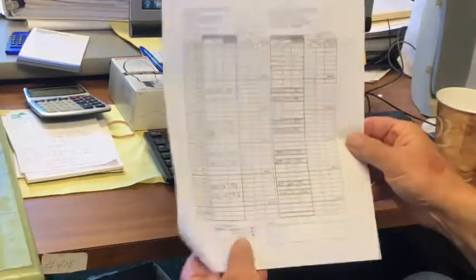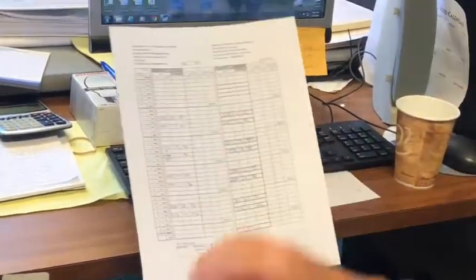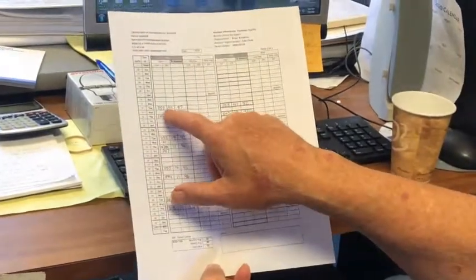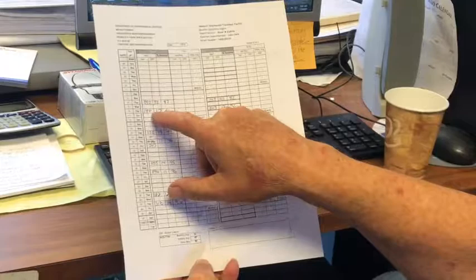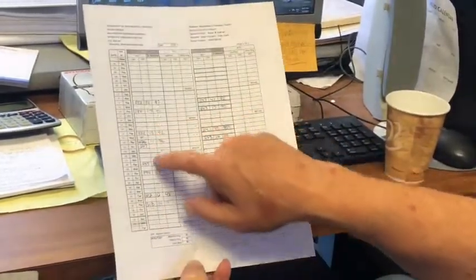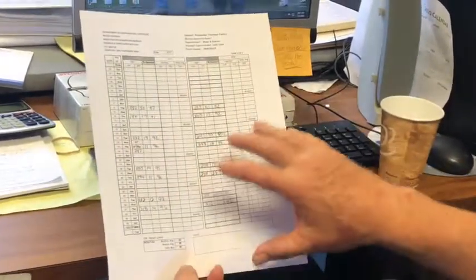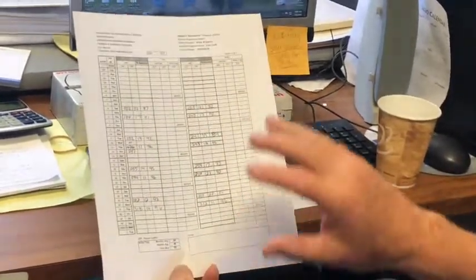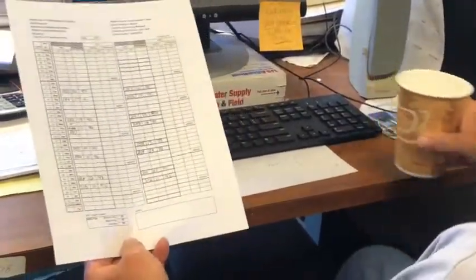And on the back of this, you have what is required. The suspended solids test, like I showed out of the permit, we have to do it twice a week, which is right there. The BOD, twice a week. And this goes on for the whole month. Now, once all this is done, we take this information and we put it in the computer. And that's where it's going to get confusing.